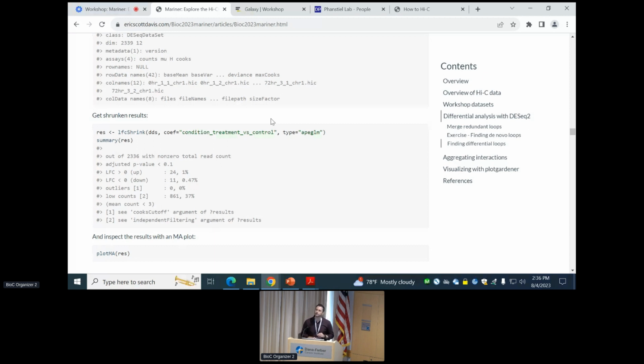I think the choice in software matters very little. As long as you have a count table, you can use any of the other available packages for that as well. We like DESeq. We know Mike Love. Yes, we like DESeq.